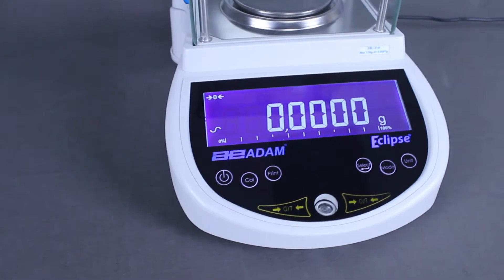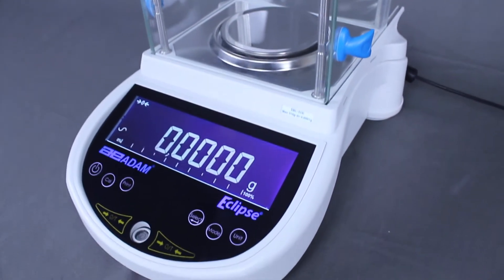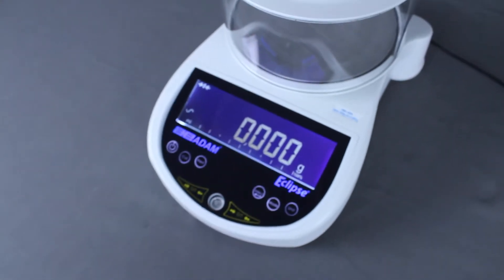Adam Equipment's Eclipse analytical and precision balances combine innovation and brilliant precision, bringing a balance of durability and performance to any lab.